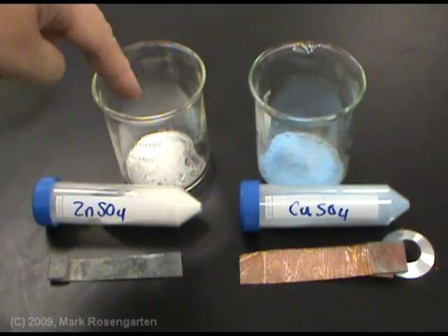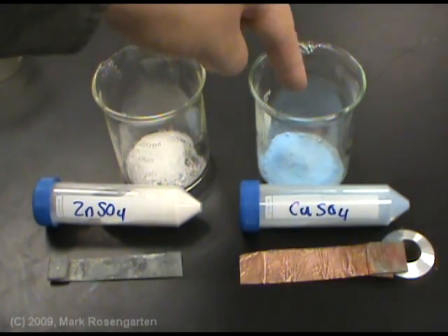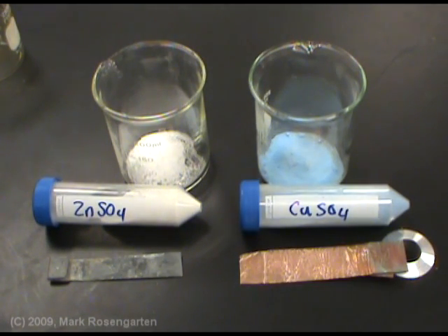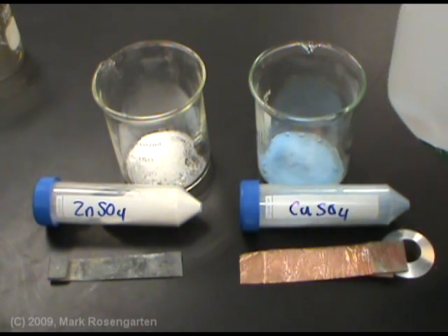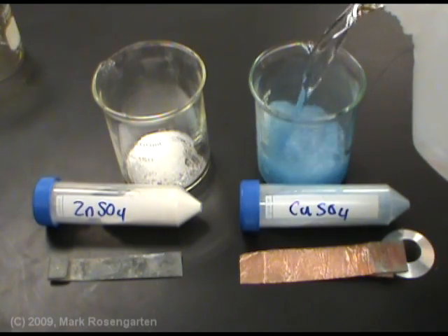In this beaker, we have some zinc sulfate. In this beaker, we'll have copper sulfate. To put the ions into solution, we'll simply dissolve them in some distilled water.